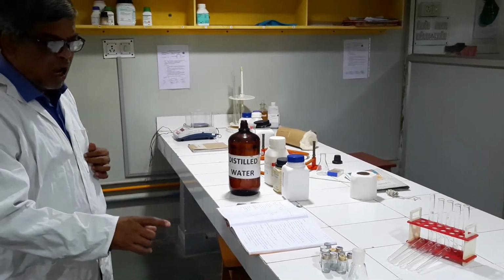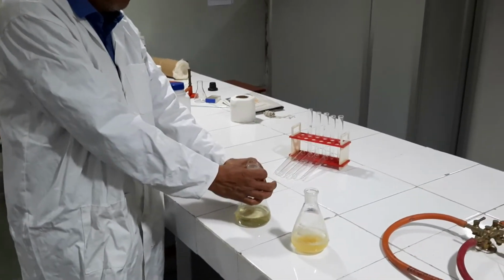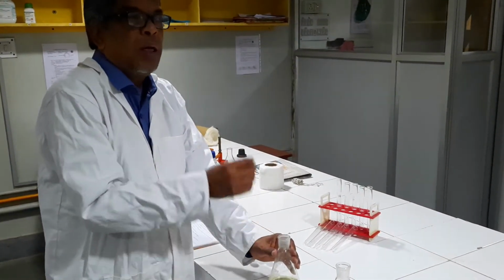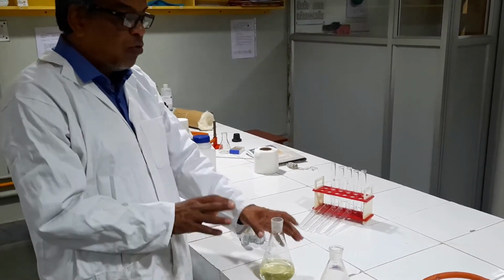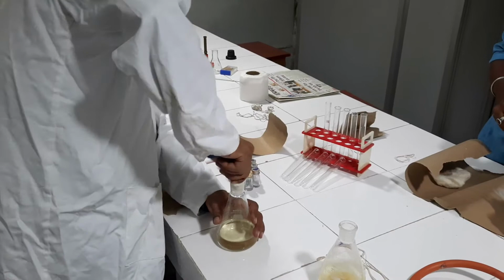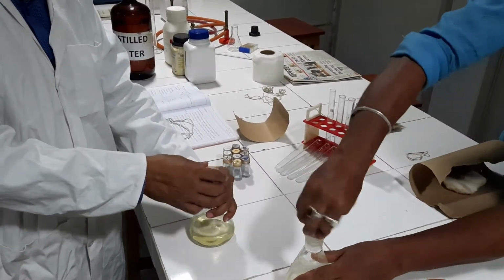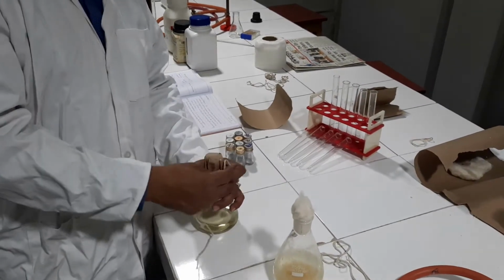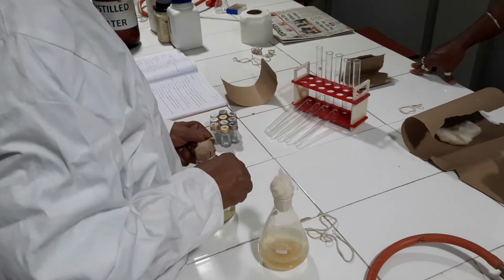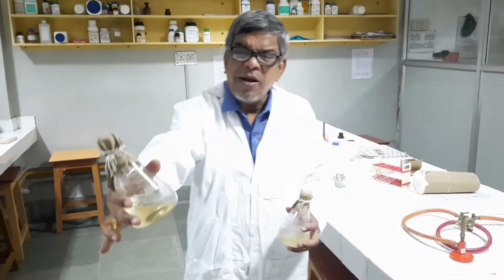Now I will cotton plug it, and butter paper and brown paper will be given. After plugging the cotton, I will put butter paper and brown paper and tie with a rubber band, or better with a thread, because rubber bands often burst in the heat of the autoclave. Taken threefold and it is plugged in the conical flask so that the mouth is covered and no water should come out of the media, because it will boil, and the water should not come out. For this reason it was cotton plugged. Students, so liquid media is prepared, solid media is prepared.